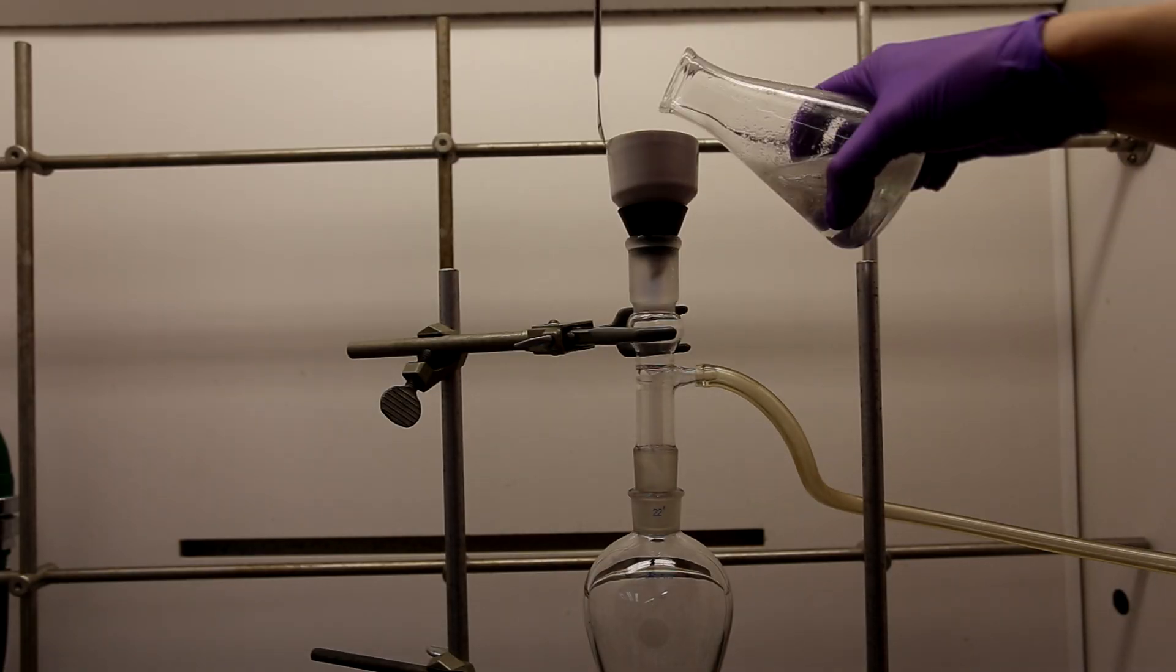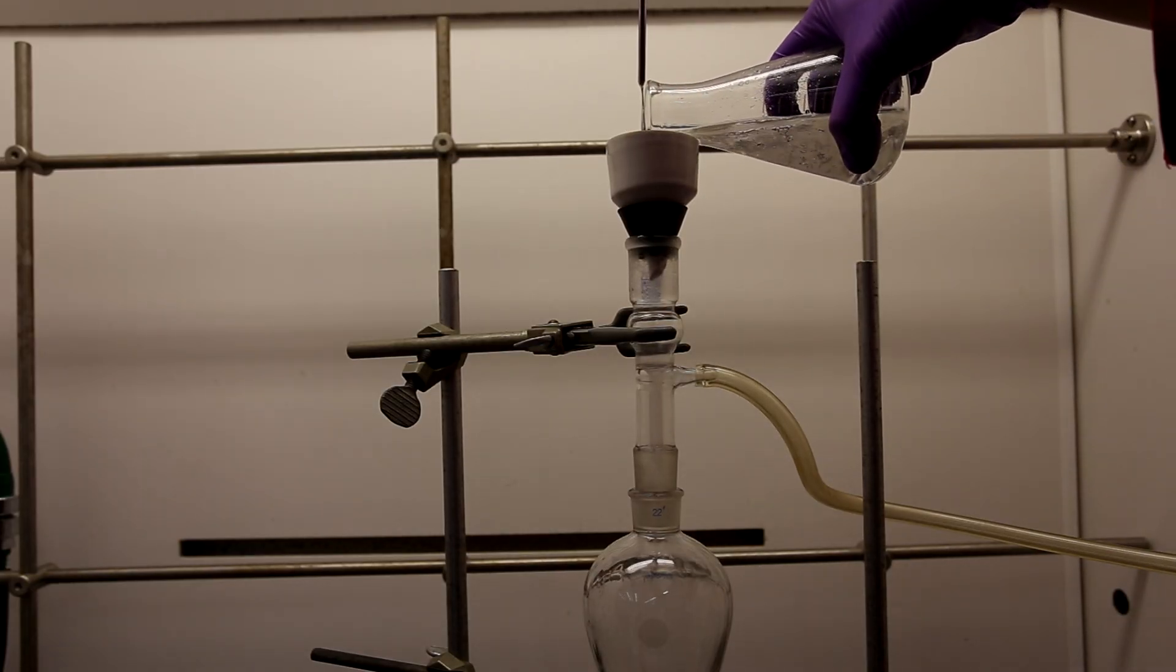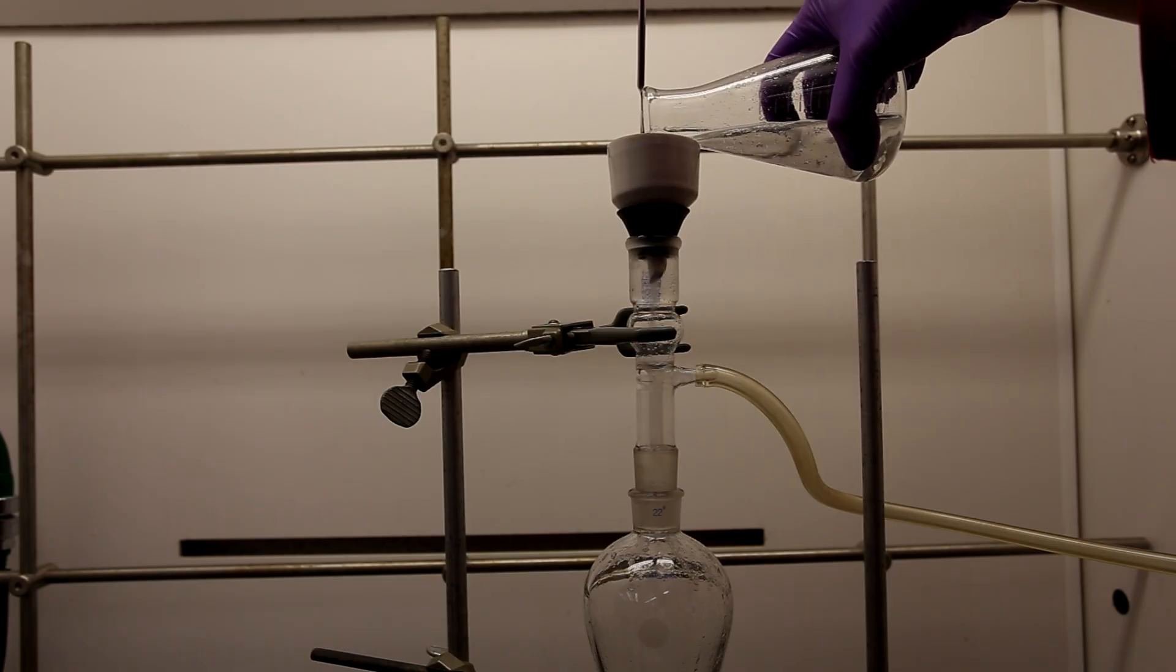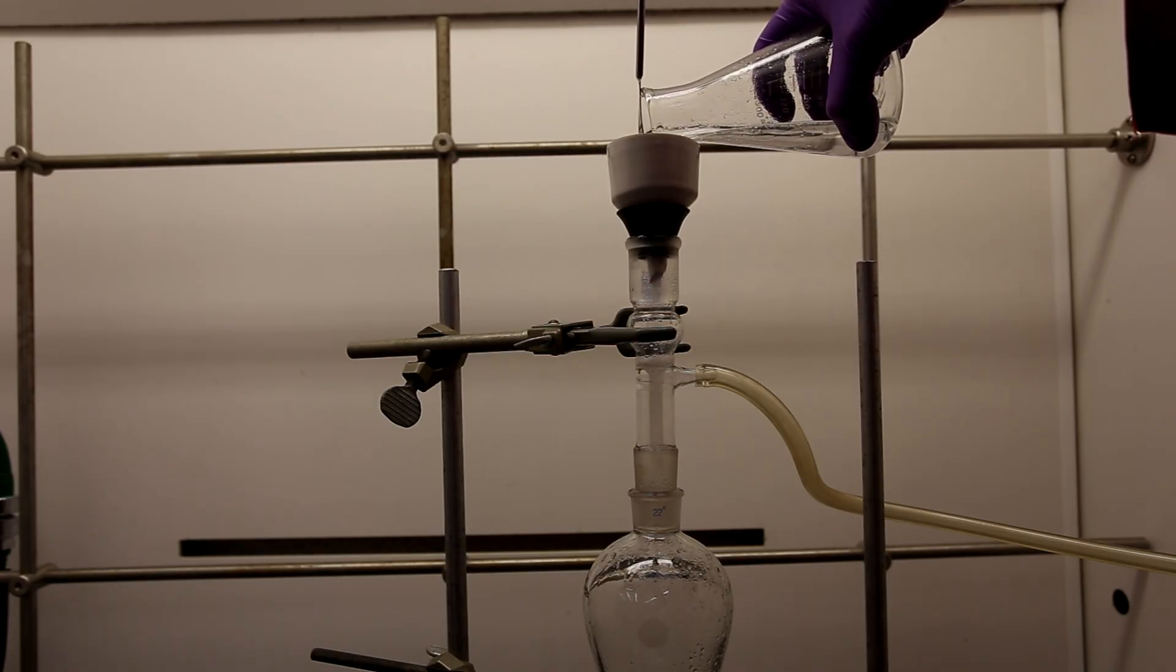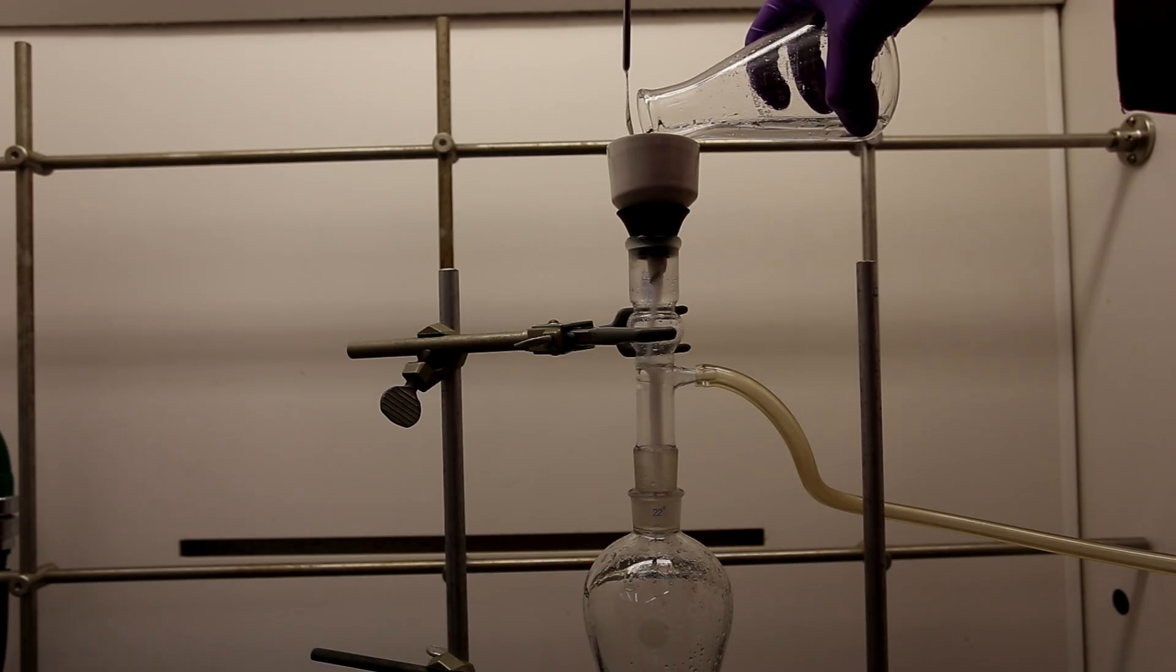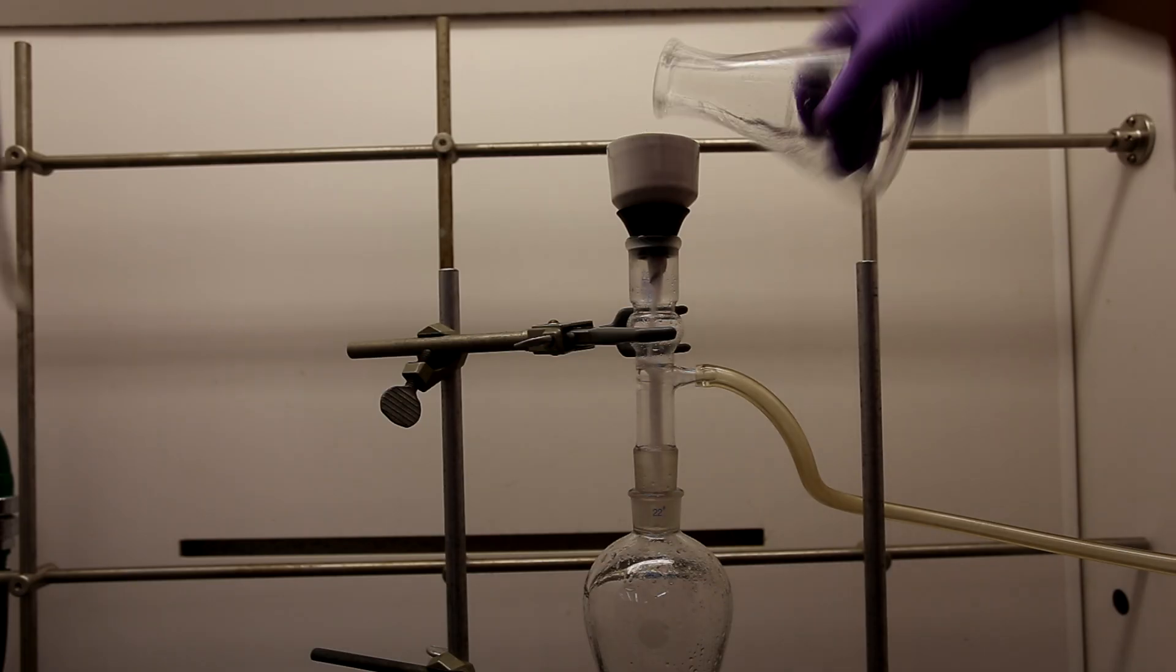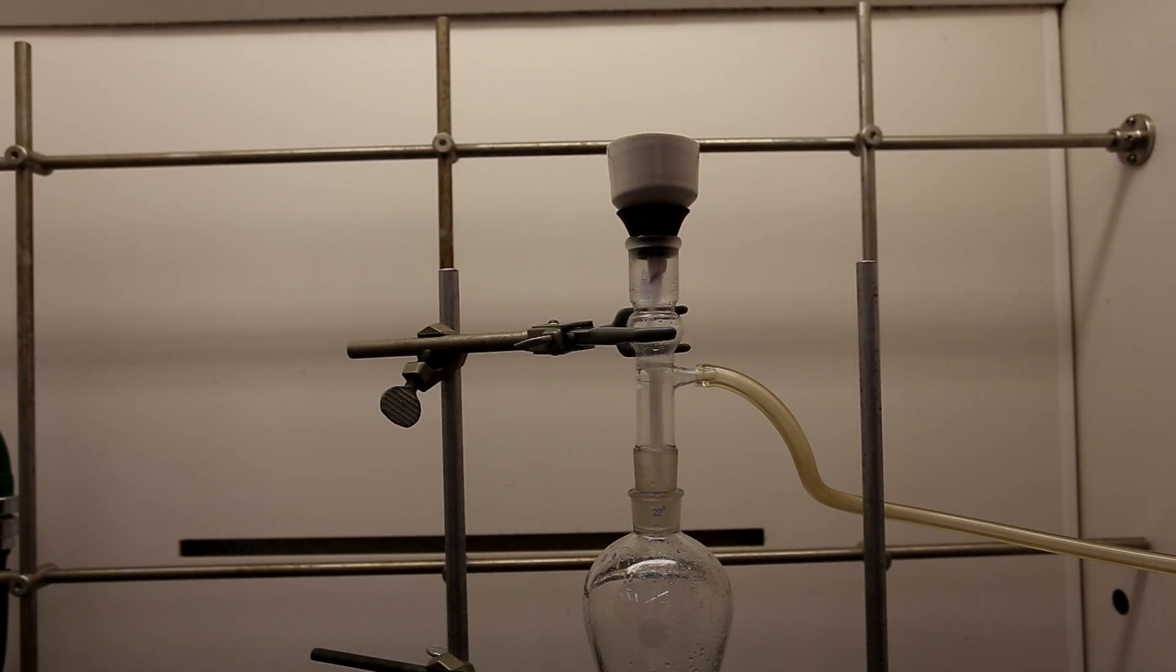Then, I directly vacuum filtered the solution into a separatory funnel. This step is necessary to remove any unreacted magnesium metal, but you definitely don't need to use the same setup that I did. Directly vacuum filtering into the separatory funnel just saves a few steps.